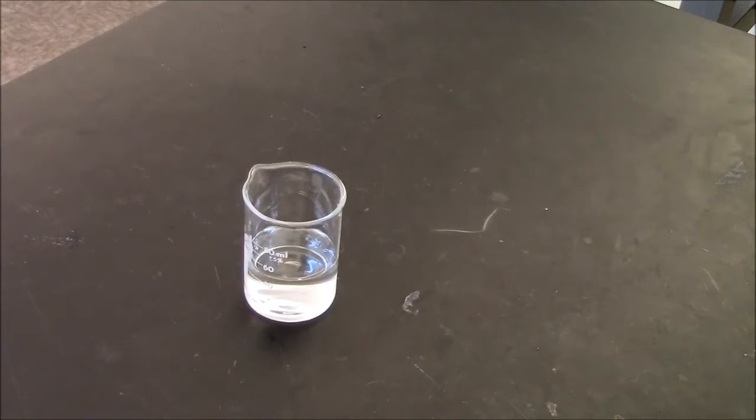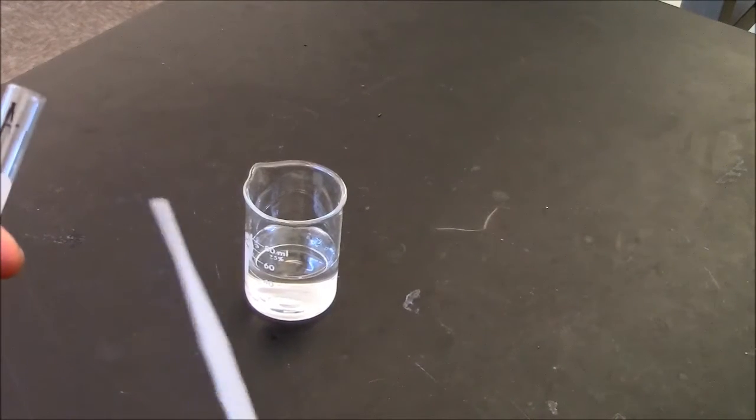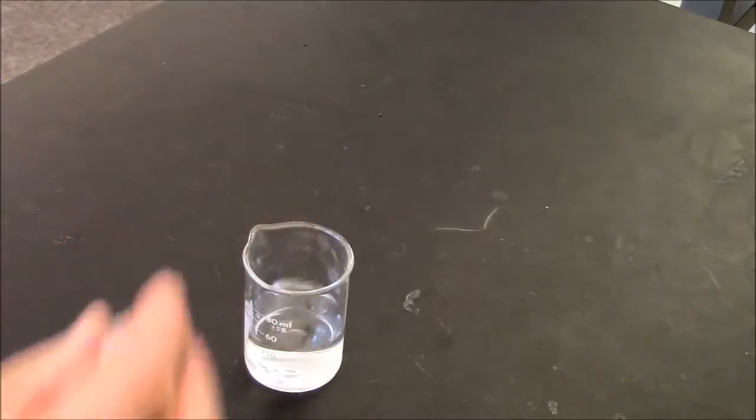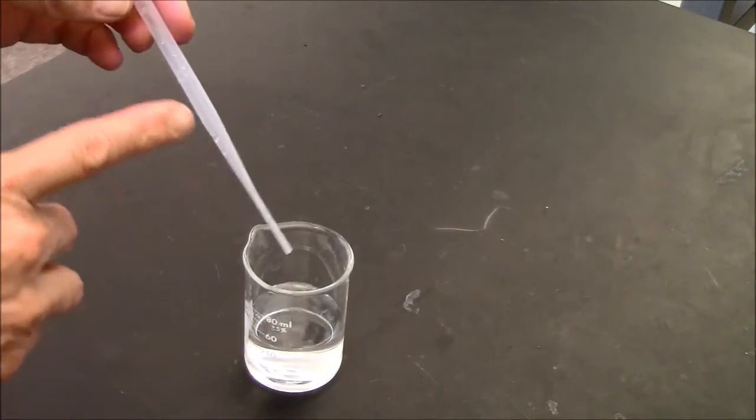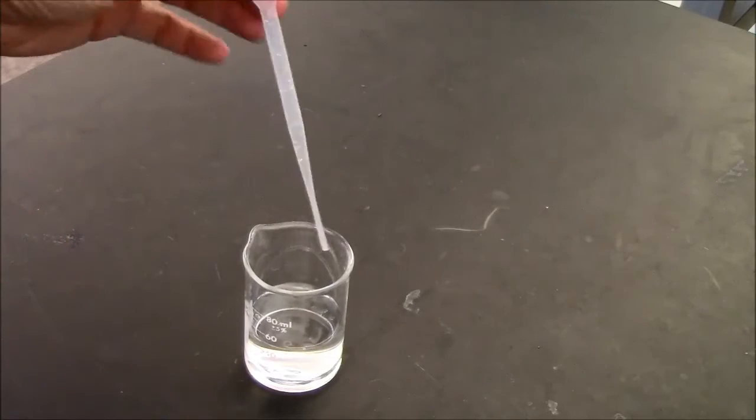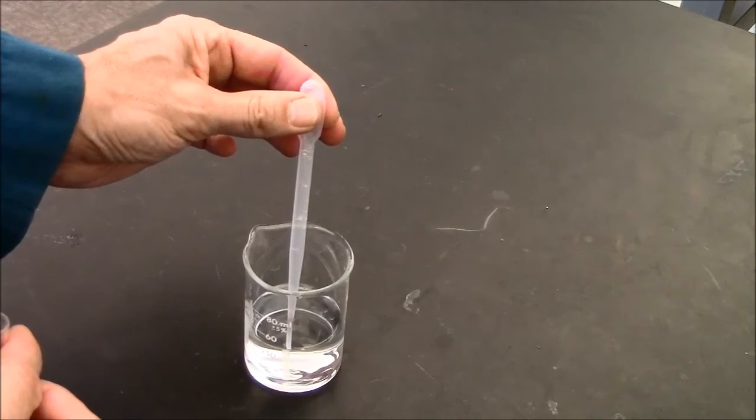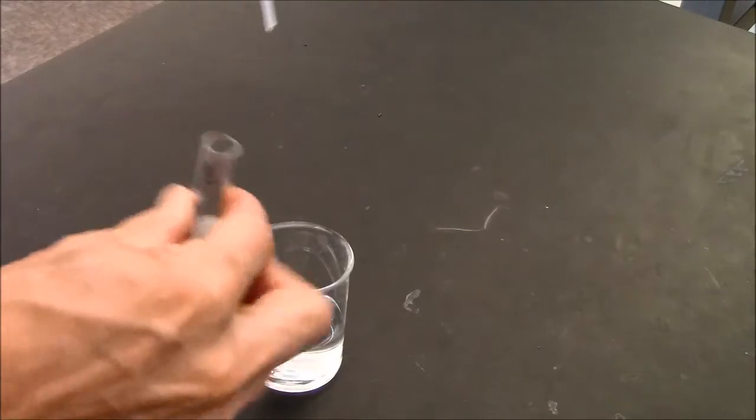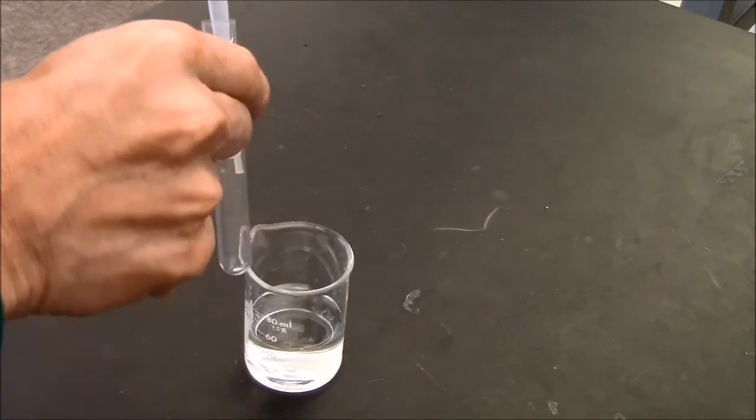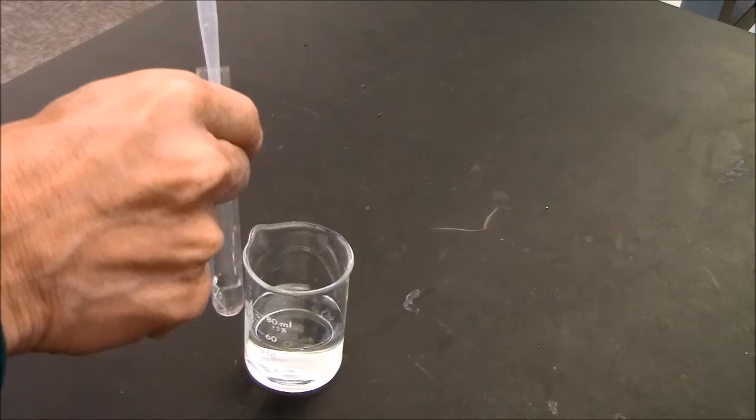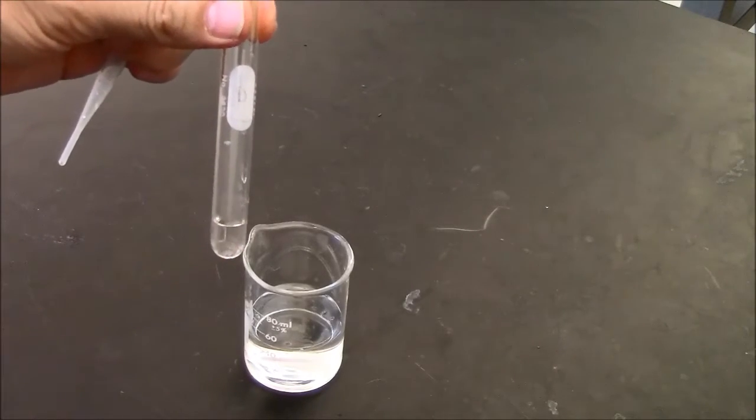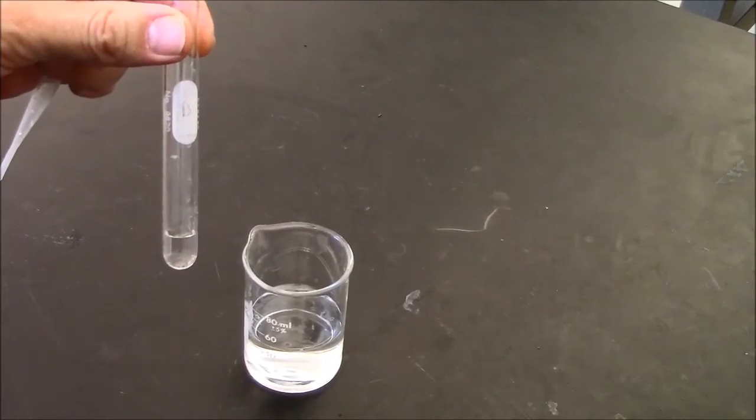If you're doing the color test, volume matters. So use one milliliter. You'll remember that the pipette has a line in the middle. This is one milliliter. And if you transfer that precise volume to your test tube, then this is great for the drops of ammonia, five drops of ammonia.